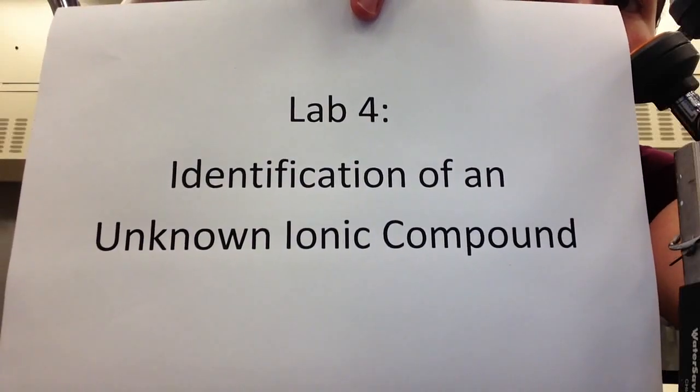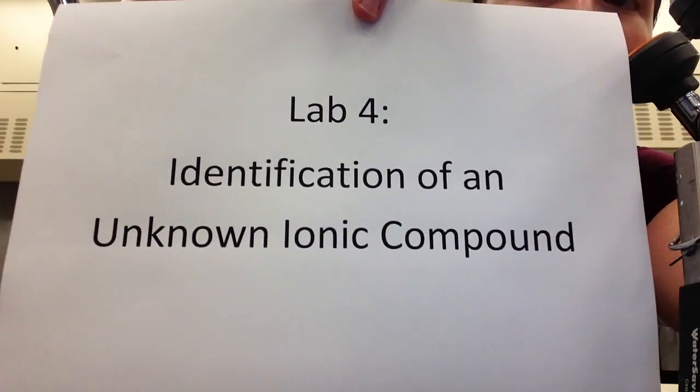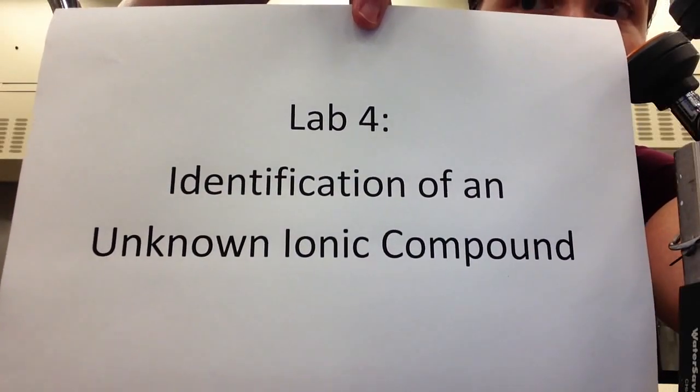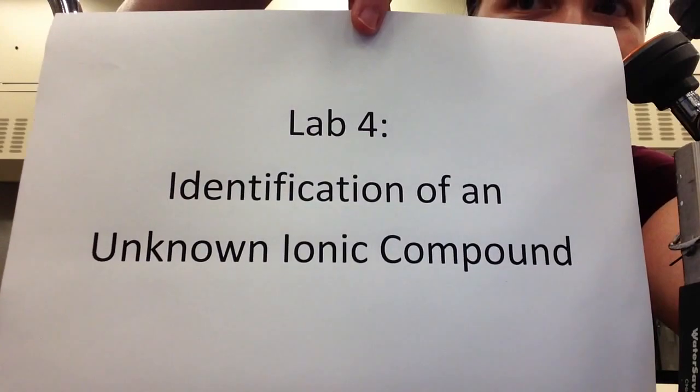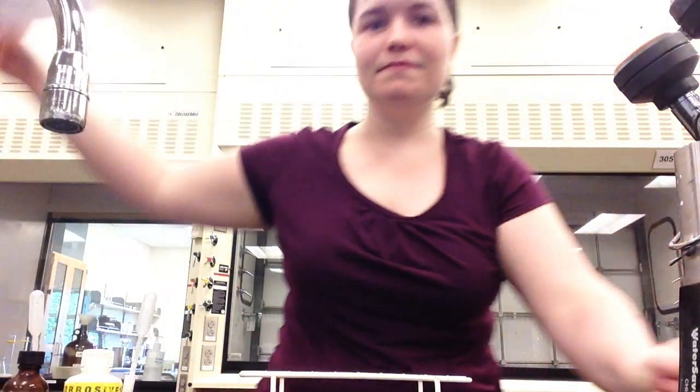This is the Chemistry 121 lab safety video for identification of an unknown ionic compound. In this lab, you will be experimentally determining the physical and chemical properties of a set of known cations and anions.